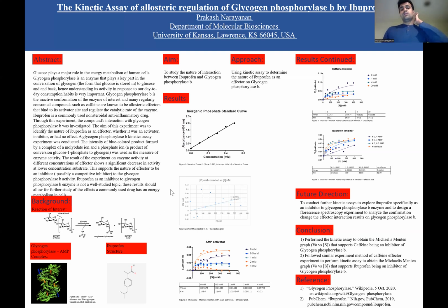Now, let's look at the results. Figure 1 shows how absorbance increases with increase in inorganic phosphate concentration in the presence of molybdate ion. It increases linearly or proportionally.